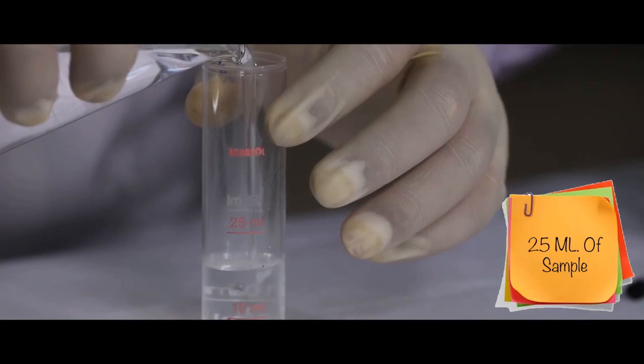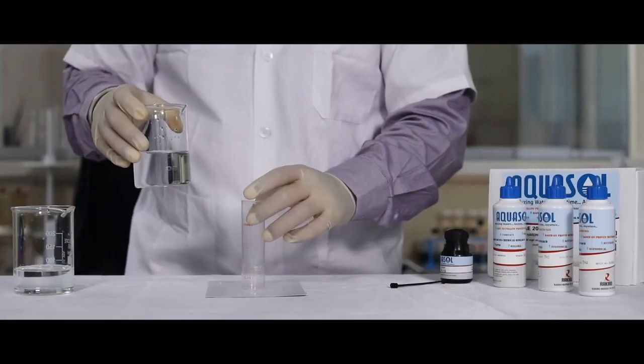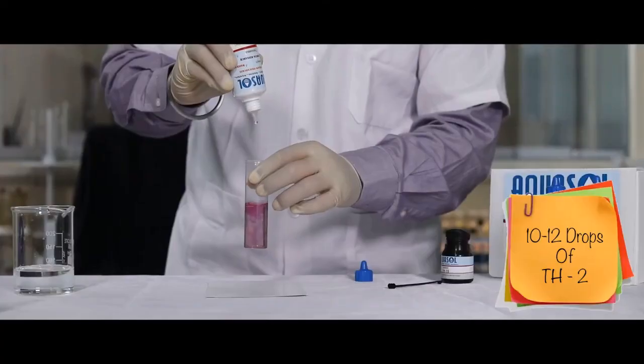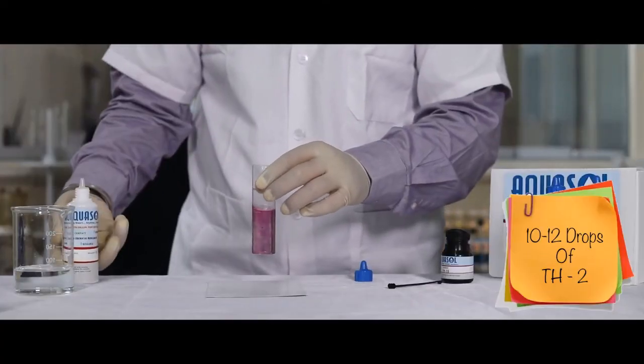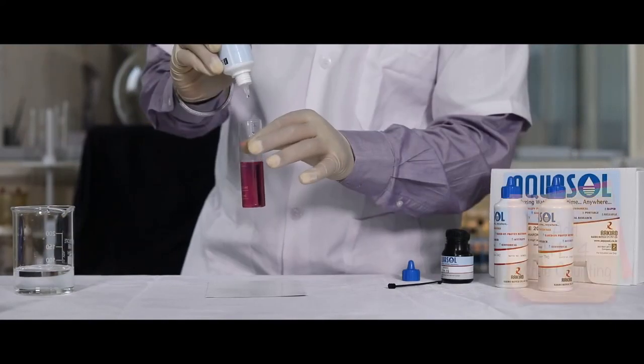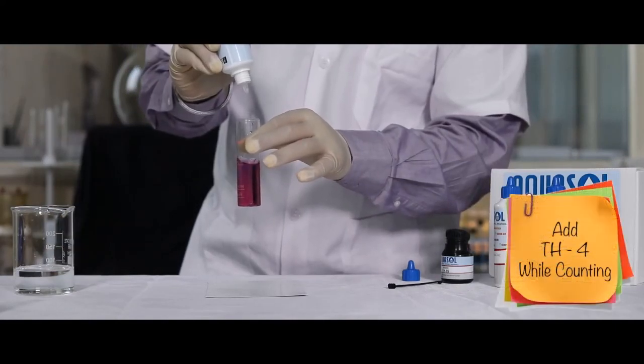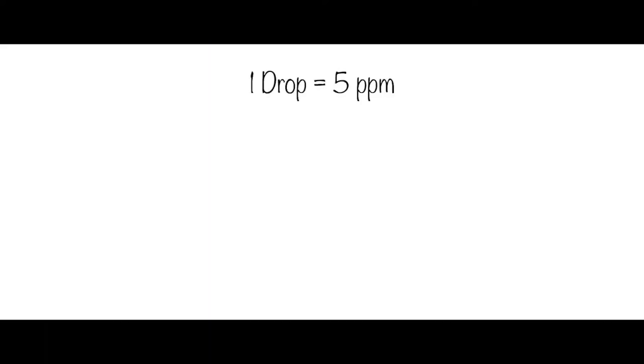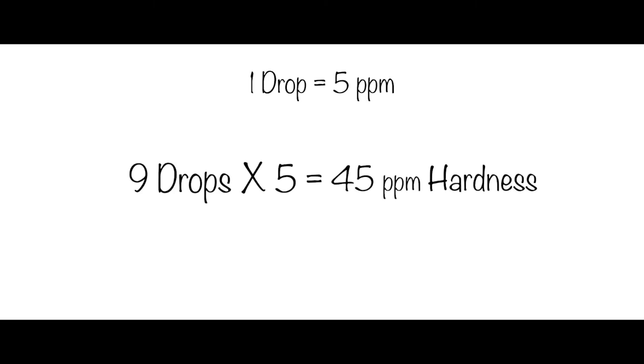Number of drops of TH4 reagent multiplied by 5 is the hardness of the sample. For example, 9 drops of TH4 reagent added, that is 9 multiplied by 5, which is 45 ppm is the hardness of the sample.